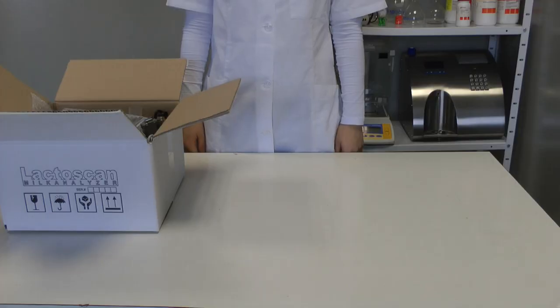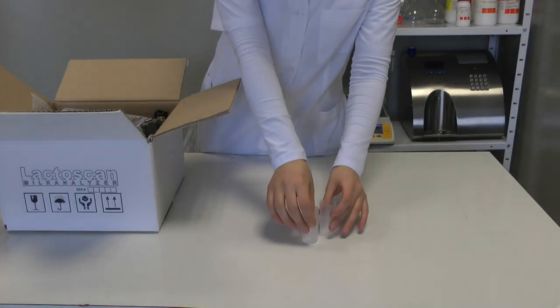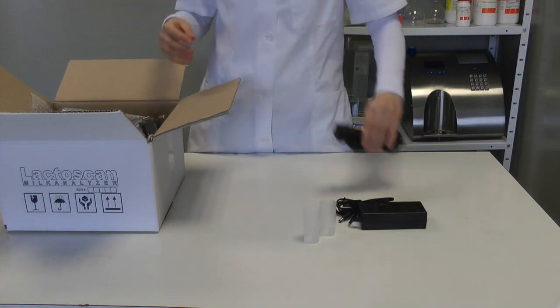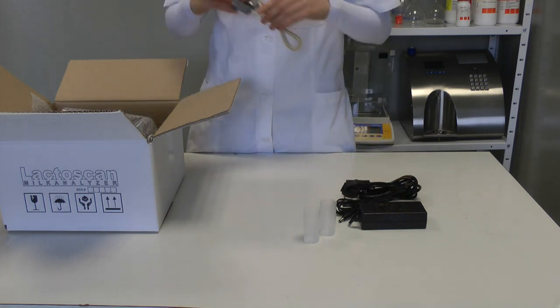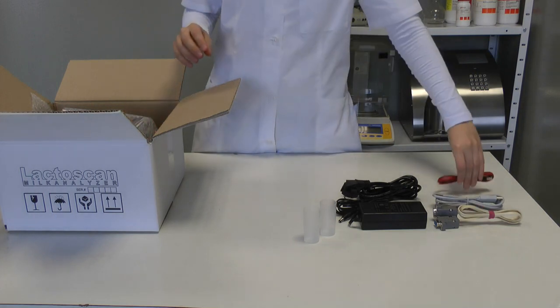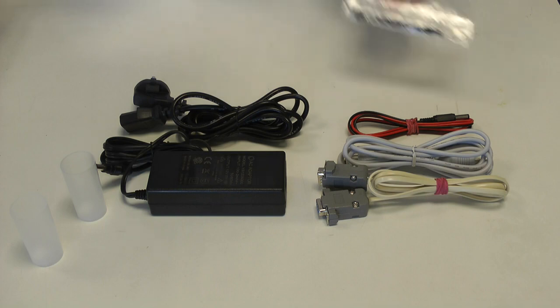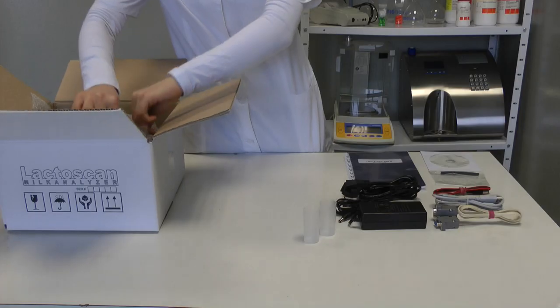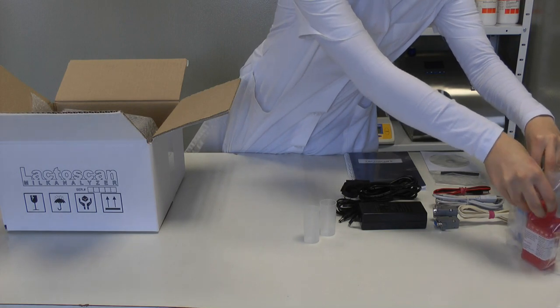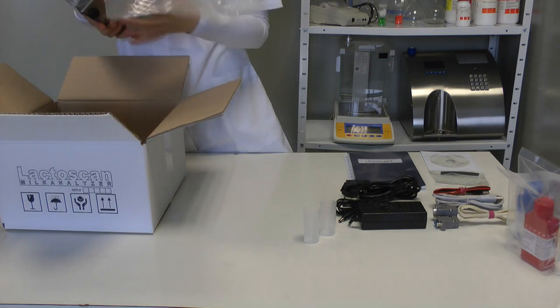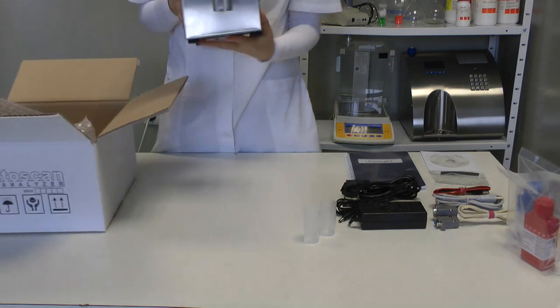Simply open the box by cutting the scotch tape. Inside the box you will find two plastic mugs, switching adapter with power cable, RS232 printer and interface cable, USB interface cable, cable for connection with car lighter, red and black, spare tube for the pump, CD with software, operation manual, two bottles of cleaning solutions alkaline and acidic, and the analyzer itself.